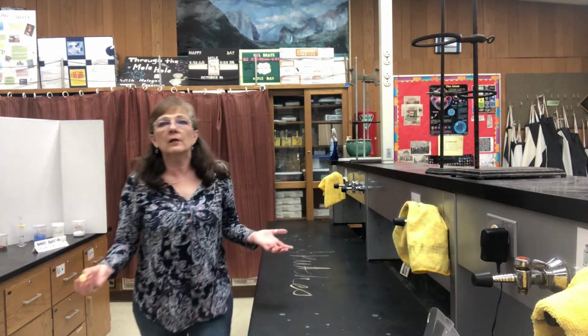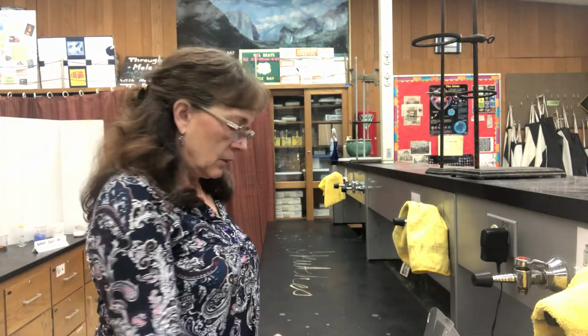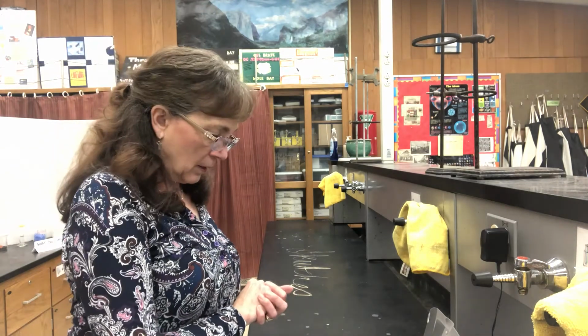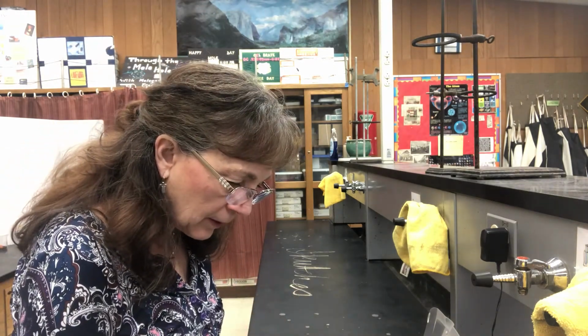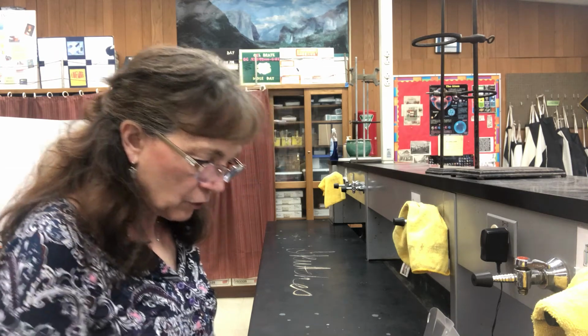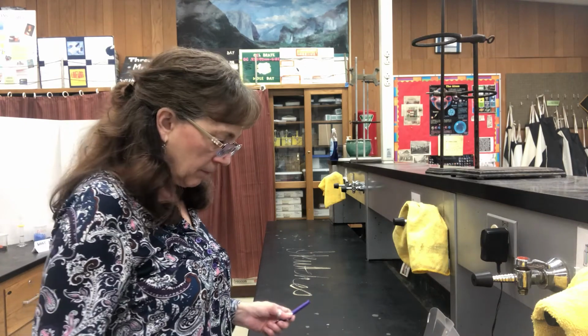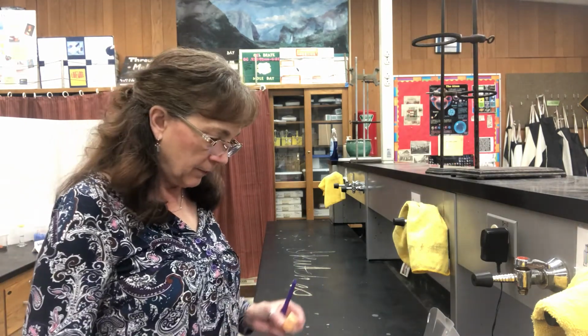And probably you can figure out there's going to be less chalk here than when I started. So I'm going to put my chalk back on here. I'd already zeroed it. And there is now 7.29 grams of chalk, no longer 7.33. So what do we do with all of that?